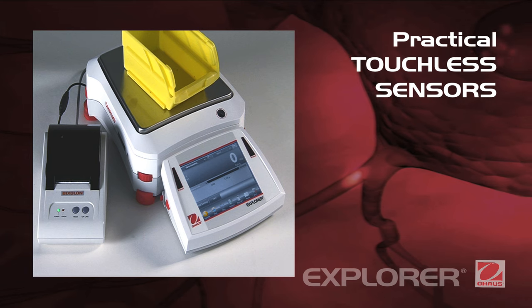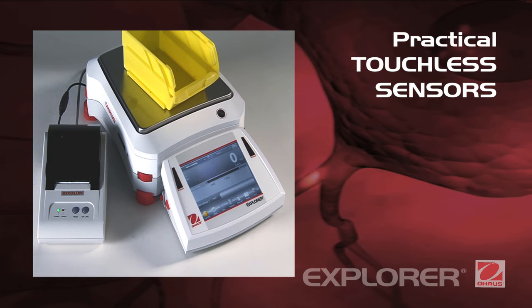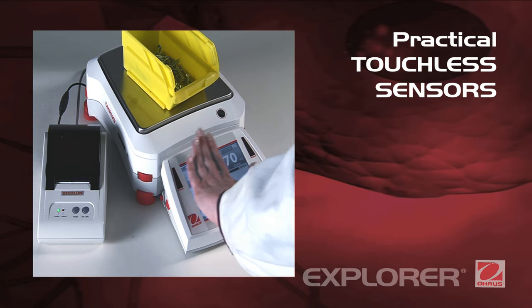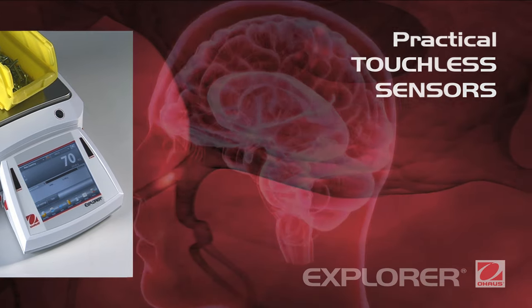Practical touchless sensors. Explorer features four touchless sensors for hands-free operation of print, calibration, and tear, helping to improve weighing efficiency and eliminate sample residue transfer.